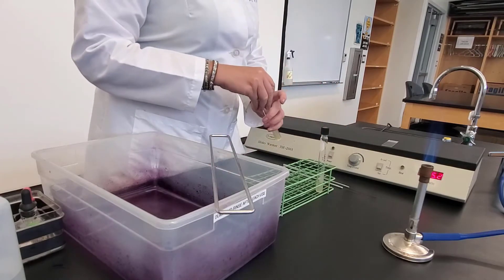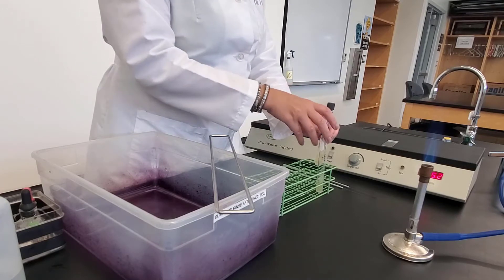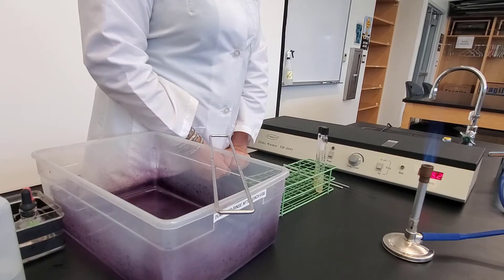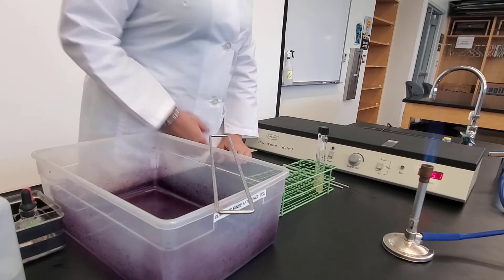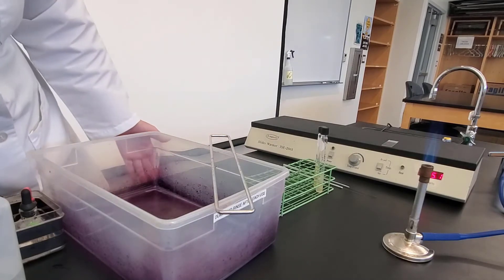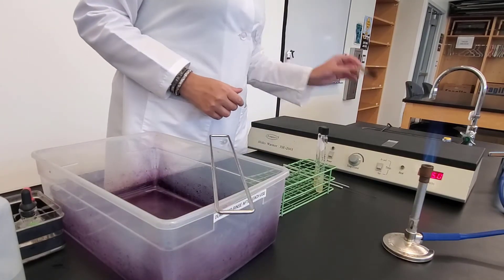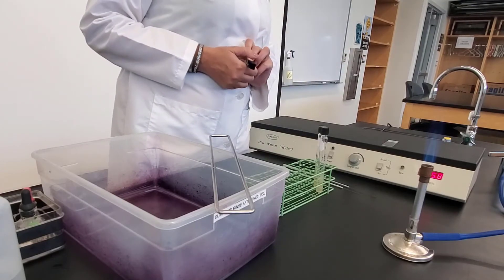So what I'm doing now is I'm letting my slide air dry. And then the next thing I need to do is that I need to heat fix my slide. And so to do this, I'm going to get a slide clip. And so when this is dry, I'm going to put my slide on my slide clip, and I'm going to do three passes through the flame.